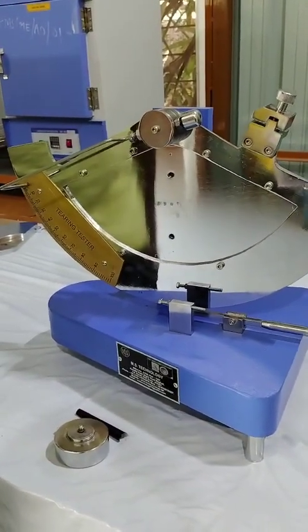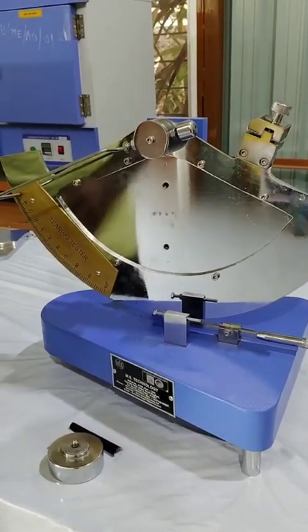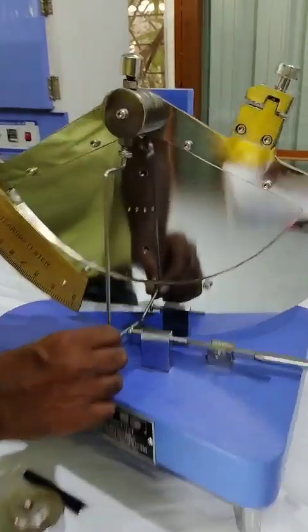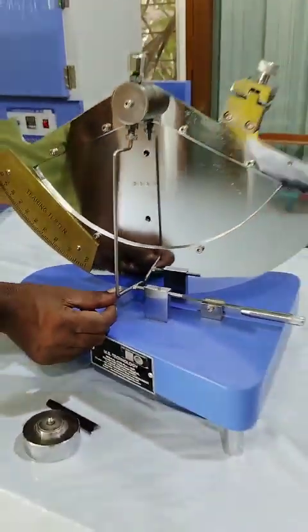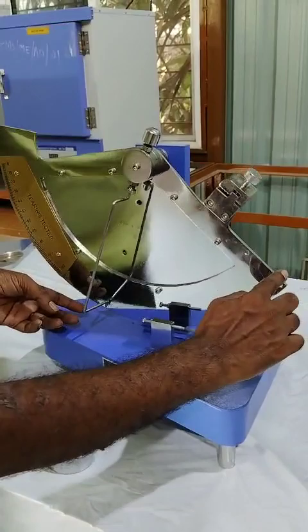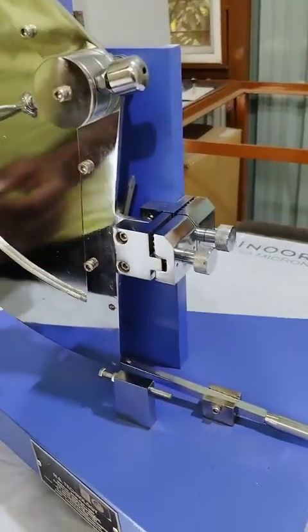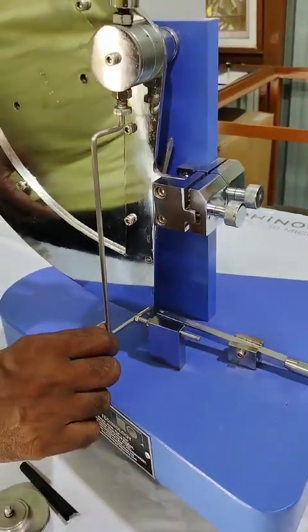First we have to calibrate the tear tester to the zero position. Keep the pointer perpendicular to the adjustable nut. Touch the pointer to the nut. After that, lift the pendulum exactly perpendicular to gravity and lock it with the release mechanism.